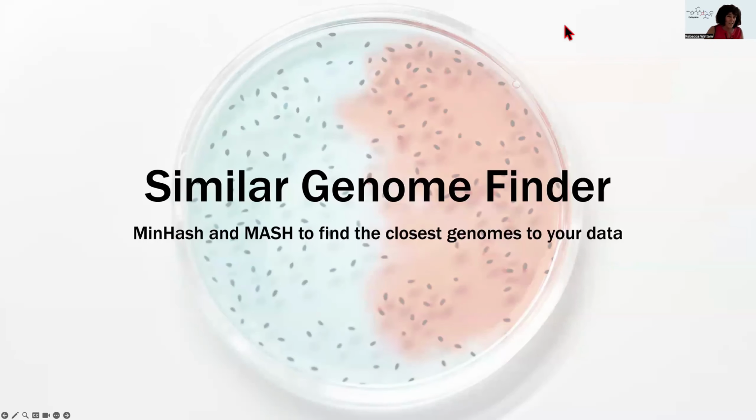In your analysis journey, some people may think that it ends after assembly and annotation because you have your annotated genome. But really, that's the beginning. And one of the first things you want to do is find out who's close to your genome. You sequence this genome for a particular reason. You wrote the grant, you got the funding, you saw something interesting in it, and you decided to sequence it.